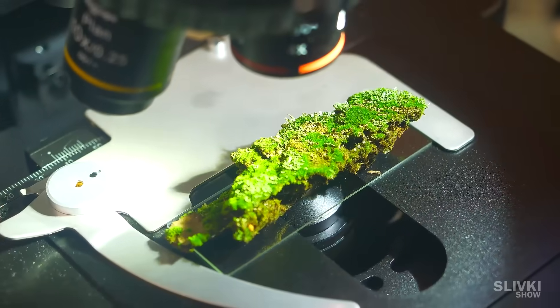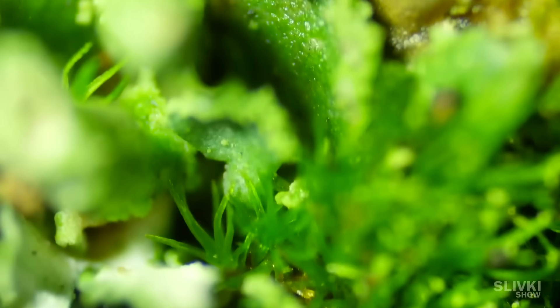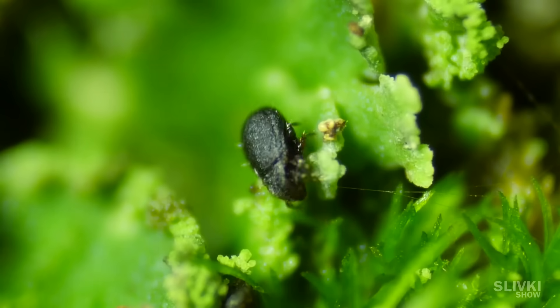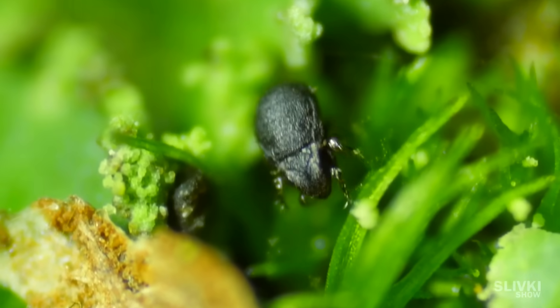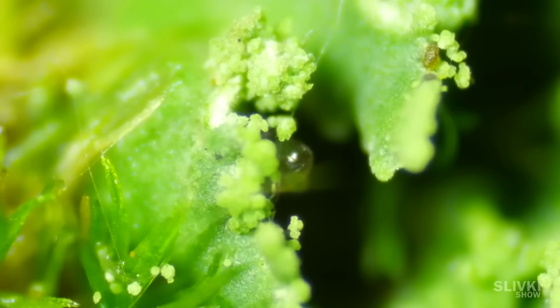Being in the woods, we took a piece of bark from a tree with moss and put it under the microscope — there were whole microscopic organisms. It's like a little jungle with lots of different trees and bushes. We even came across micro-inhabitants: a black bug wandering around in the thick looking for food. In reality it probably wasn't even a millimeter long — we couldn't find it with our eyes. And here's another one, transparent.